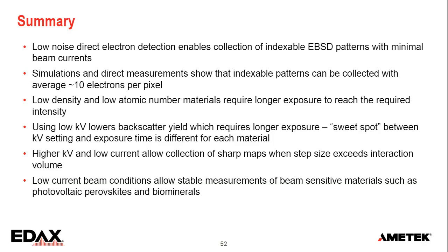What you have to keep in mind is that low density materials, light materials, require longer exposure. They have a lower backscatter yield, so also lower intensity in the diffraction patterns. And you have to find a sweet spot between the backscatter yield, which is a function of the material, but also of the kV, and the exposure time and when it starts to damage. And that will be different for every material, so it requires a little bit of experimenting.